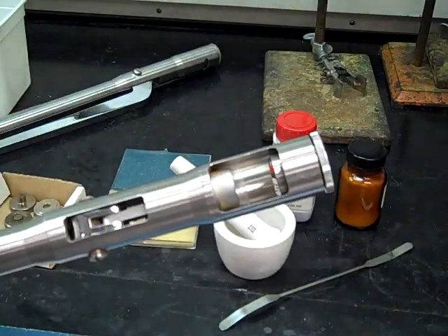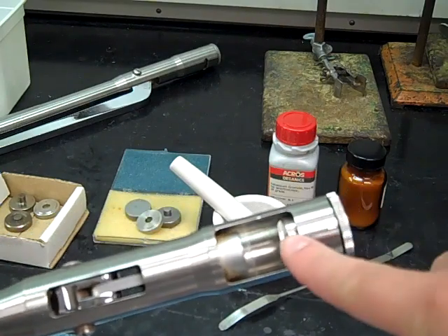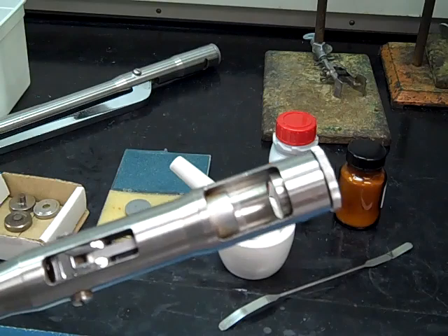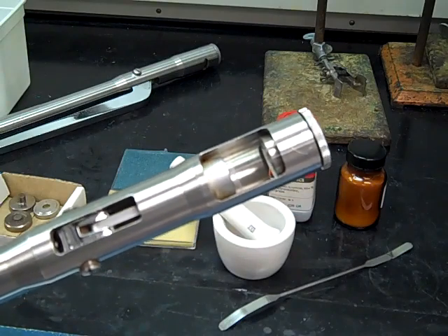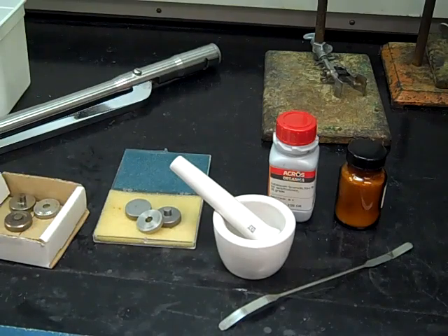Those 3 pieces of the die set will go in this little insert right in the center here, and then you'll actually press this together using this instrument. So that's all you need. Let's go ahead and get started.